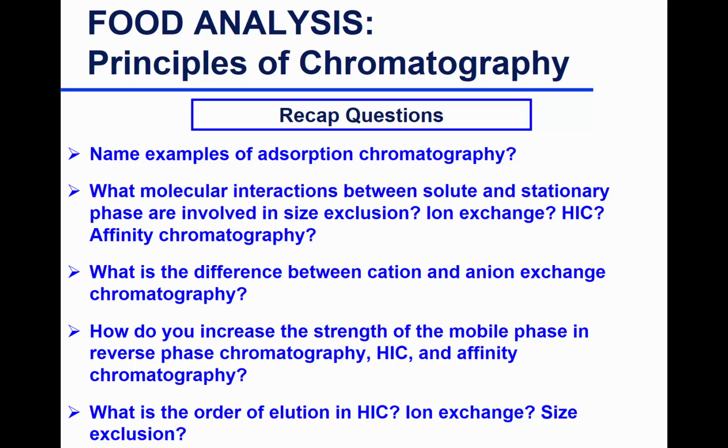What about hydrophobic interaction chromatography? How do you increase the strength of that mobile phase? Okay, so what's the basis of hydrophobic interaction chromatography? You remember? You do have functional groups that are hydrophobic, yes, but how do you make your components interact with your column?